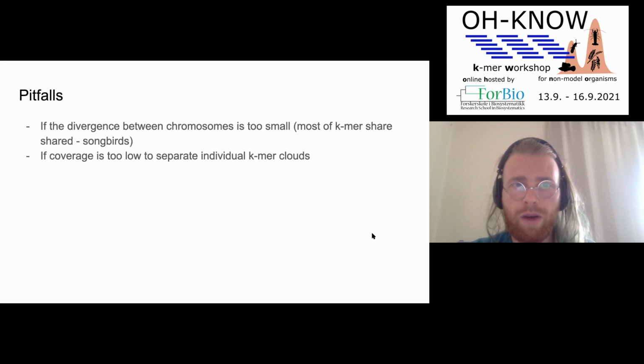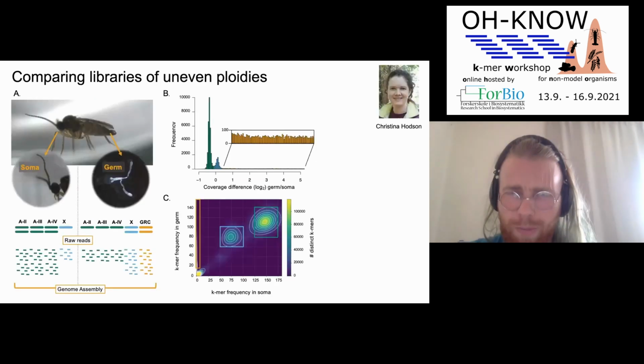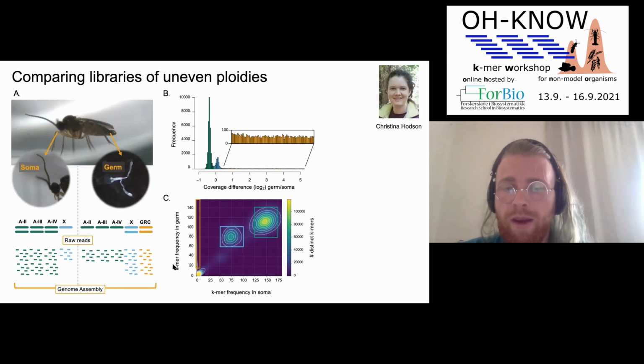So actually what I haven't explained is that what we are going to do now is to define the coverage ranges of the individual k-mers that we think will be X-linked or not. In this case we had just two libraries, so we defined it just for the two, but we can define it for as many libraries as we want. And we have 8 libraries. So for every single sample, we would like to define the left boundary of the minimal haploid coverage, the maximal haploid coverage, the minimal diploid coverage, and the maximal diploid coverage.